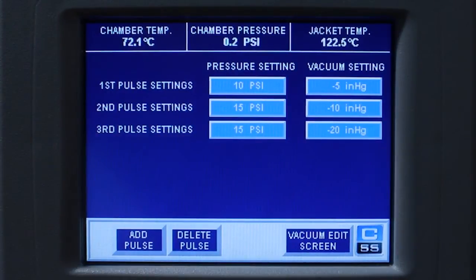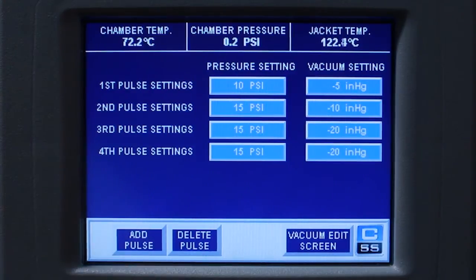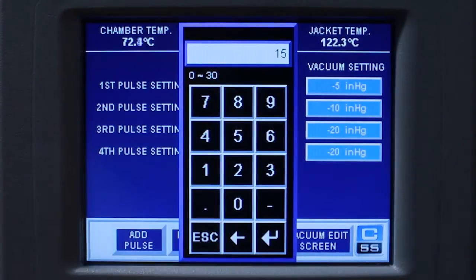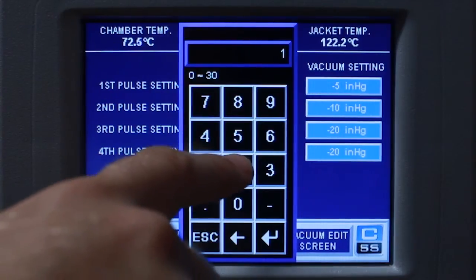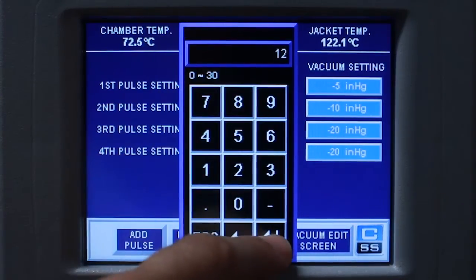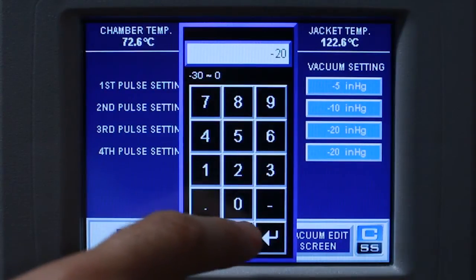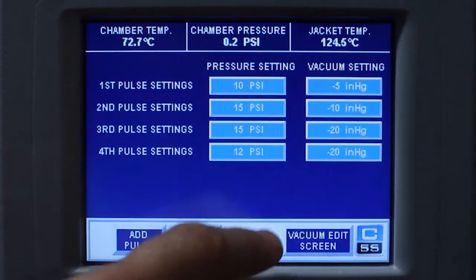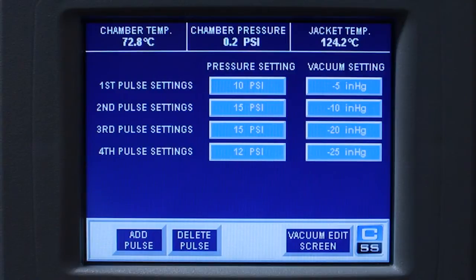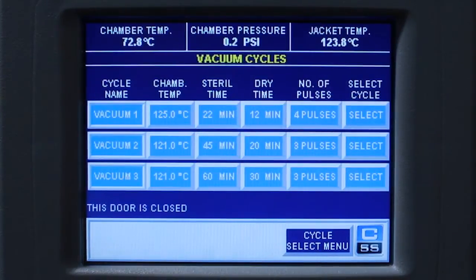If you want to add a pulse, press the add pulse button. Change the pressure setting and the vacuum setting. Return to the vacuum screen by selecting the vacuum edit screen button. Press select.